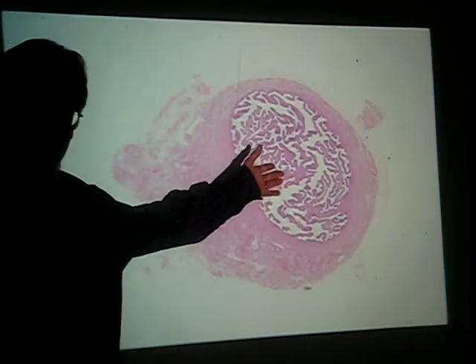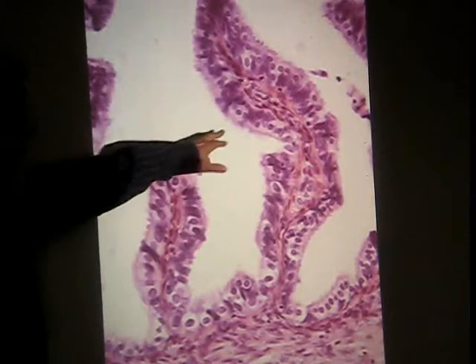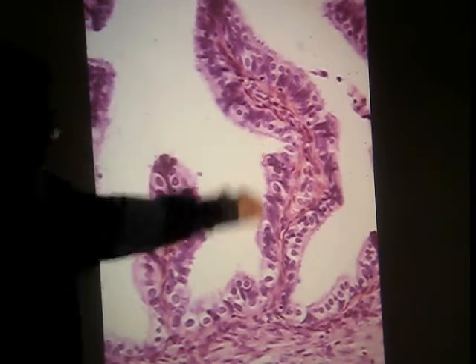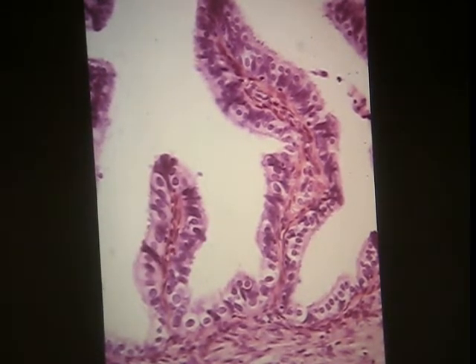Yeah. Probably going to see that. And you've got a tubular structure with a folded or plicated mucosa. And if we look at higher power, we can pick up these simple columnar cells that are ciliated with the darker staining peg cells interspersed.